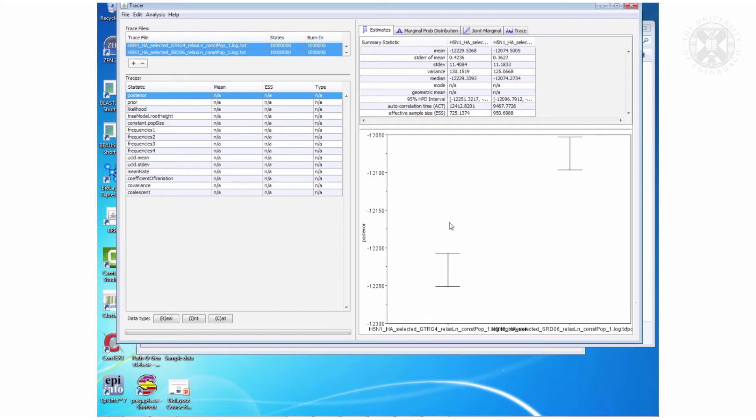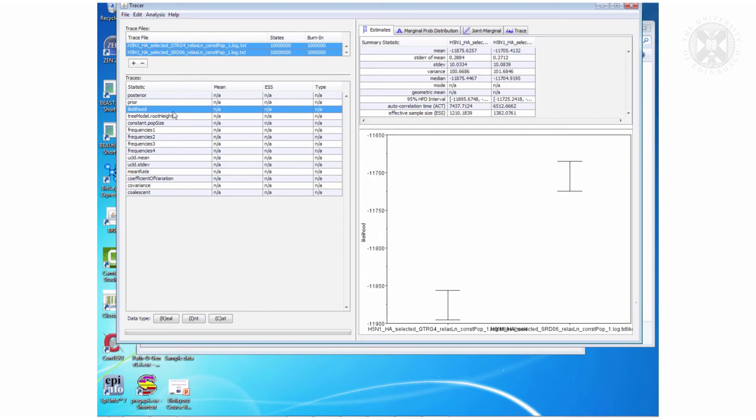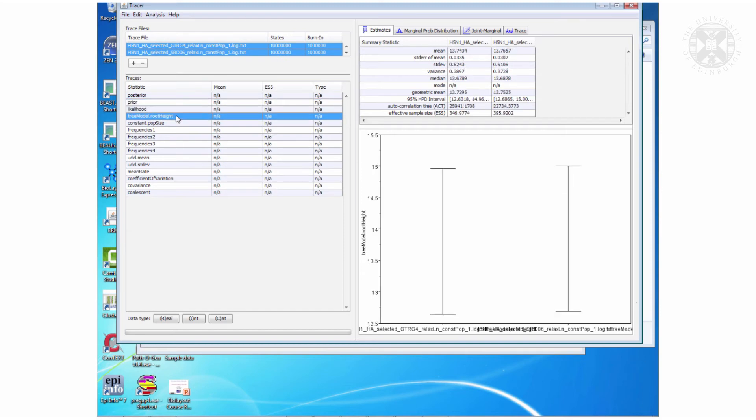So this is the first file, the GTR, this is the second one, the SRD06, comparing the posteriors, the priors, the likelihoods. But then when you look at the root height actually if you look carefully mostly these are about the same.